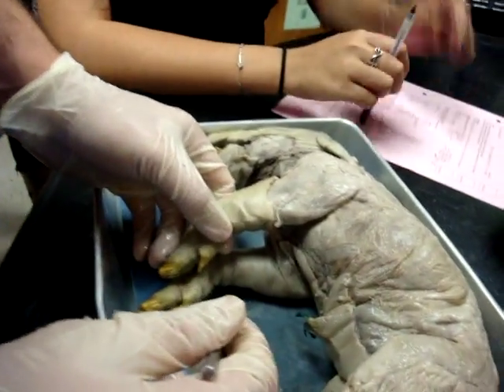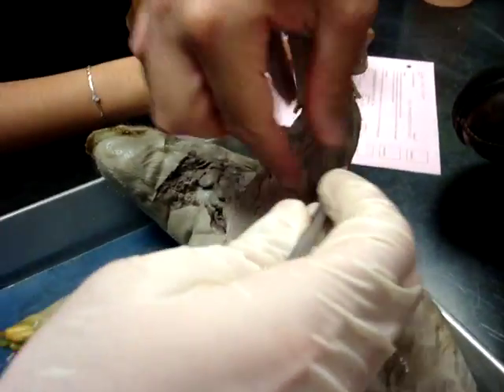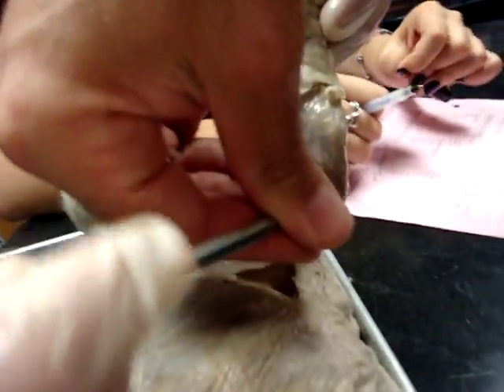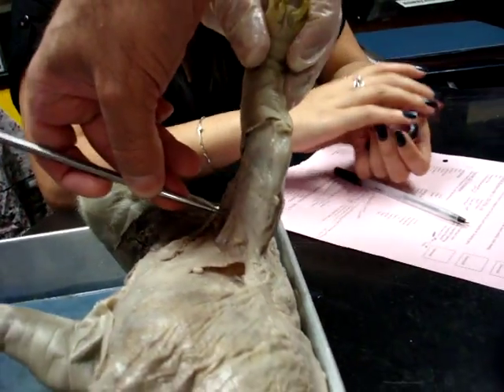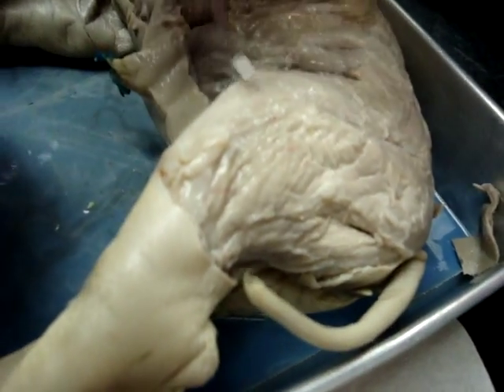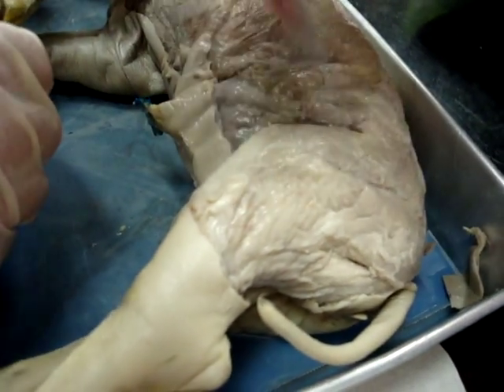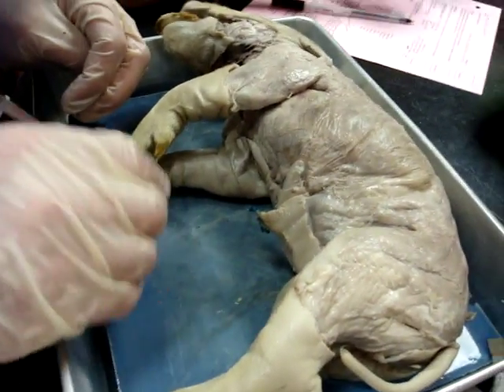Show me the triceps brachii. Very good — flip it over really quick. The muscle in this general area is your triceps brachii. Just close sides of it. Remember the bicep is up here? Biceps femoris is up there. We are done — we're just going to do the skeleton. Peace.